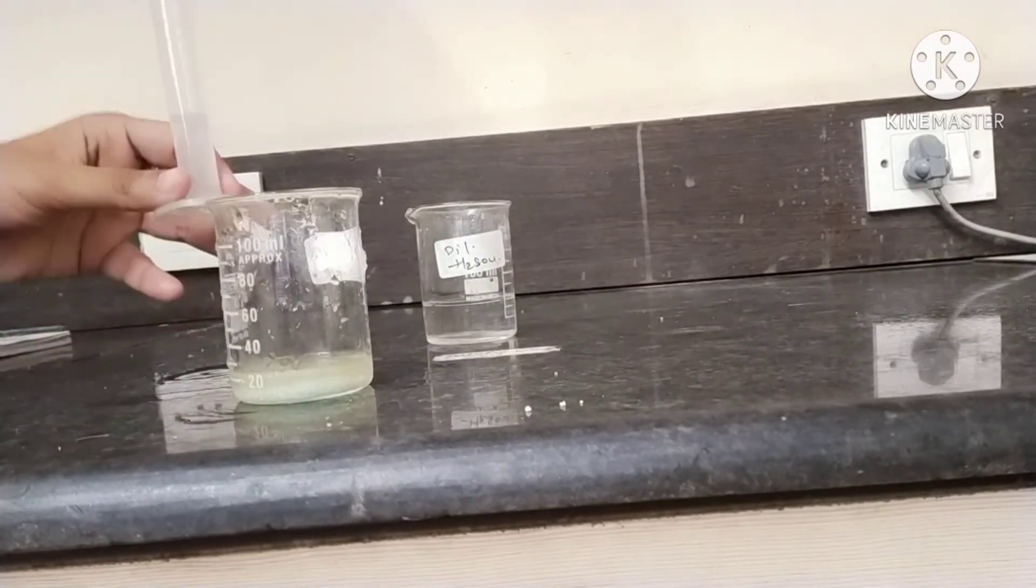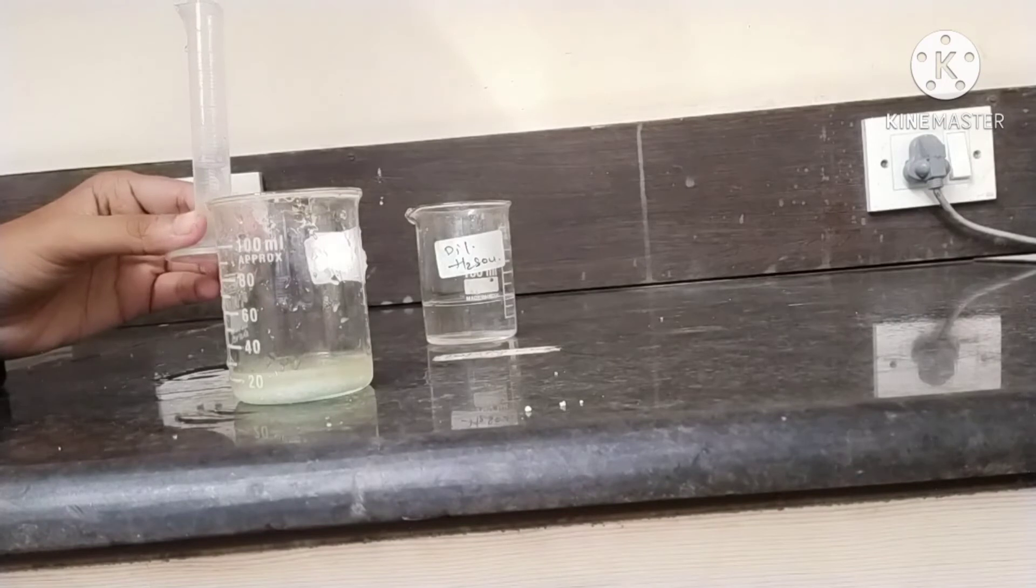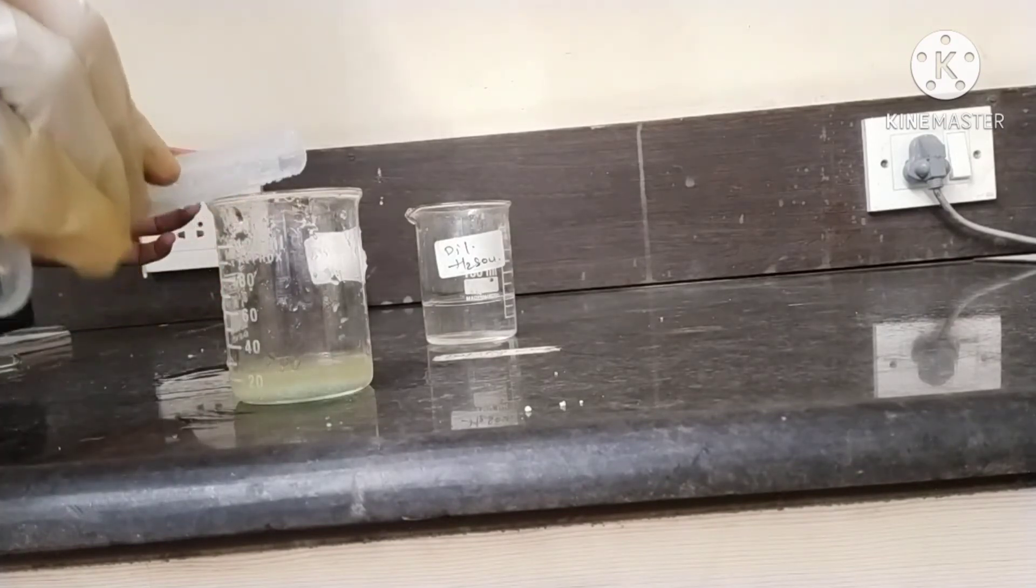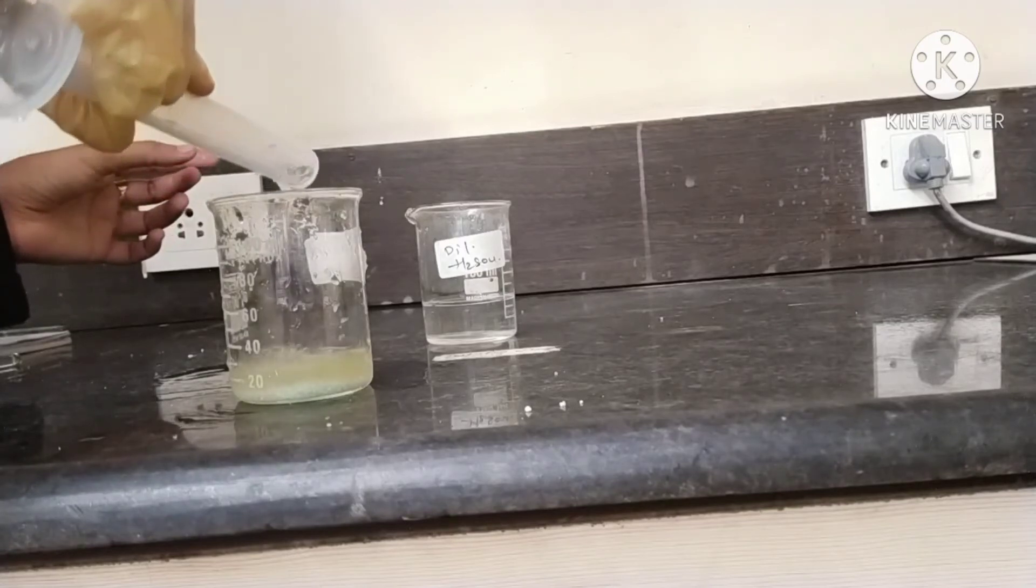Then add 2-3ml of dilute sulphuric acid with the help of a measuring cylinder.